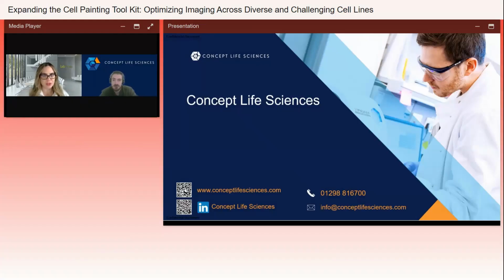All right, wonderful. We are getting a lot of really great questions in here. The next one says, how do you distinguish between autofluorescence and valid fluorescence? From a flow cytometry background, this is done with fluorescence minus one controls. Yes, so it is. It's not really amenable to FMO calibrations in cell painting.